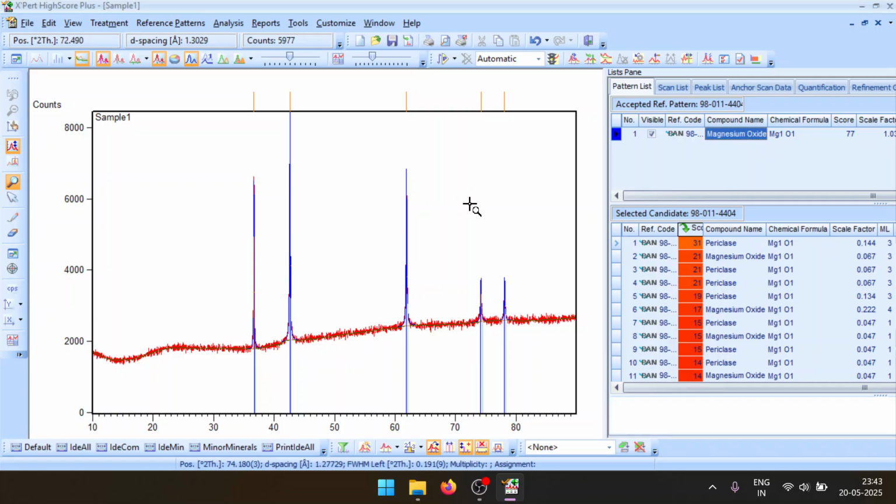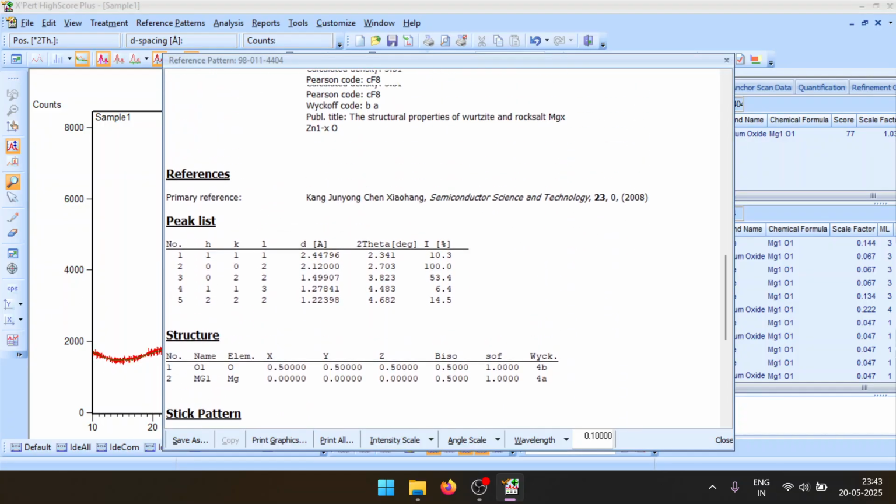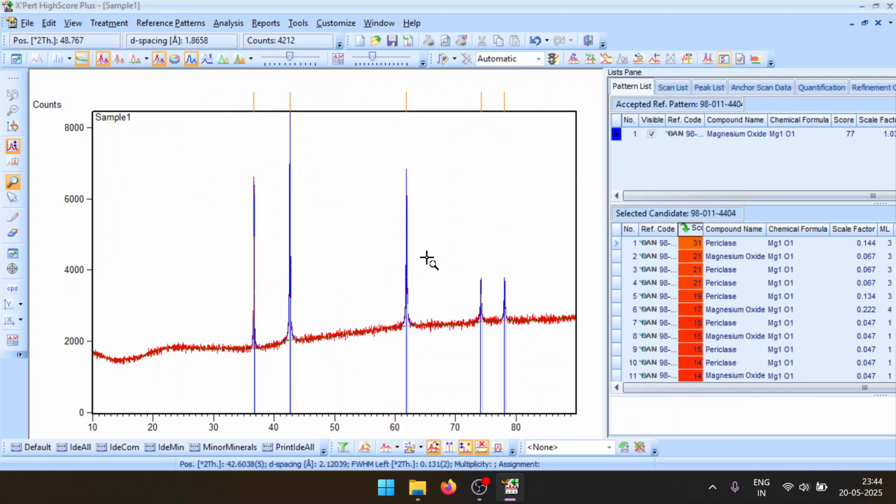This happens generally, every time, because of some synthesis conditions, and all these reference samples are ideal samples grown under ideal conditions. So this is the ideal pattern that should come, but then you have some deviation, which means some changes in ABC parameters or a bit of strain or stress, something like that.